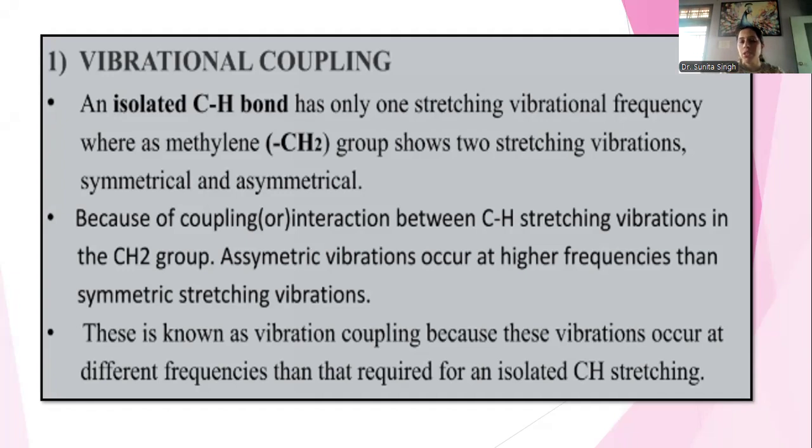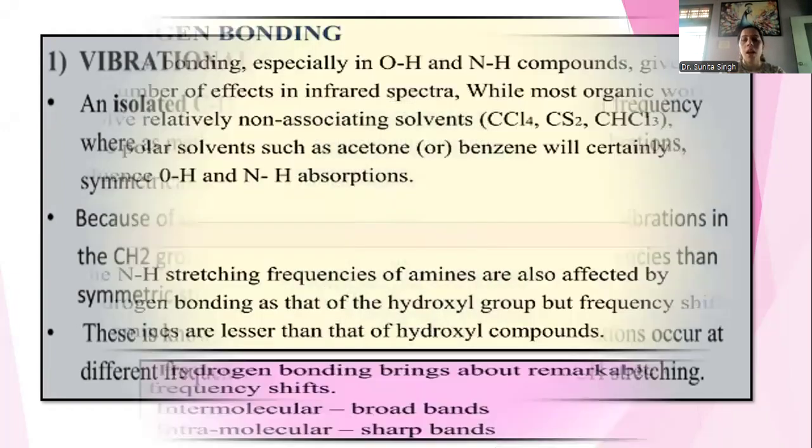So the isolated CH frequency is different, whereas the CH2 frequency is different. We can say the magnitude is different because it has symmetrical and asymmetrical stretching, in which asymmetrical stretching always occurs at higher frequency.